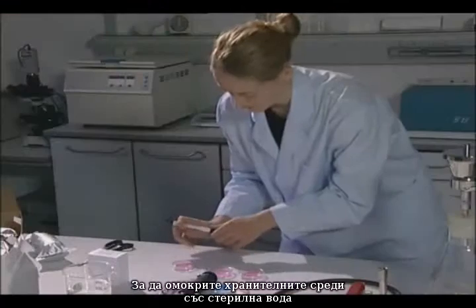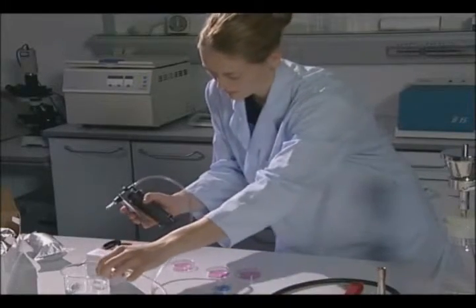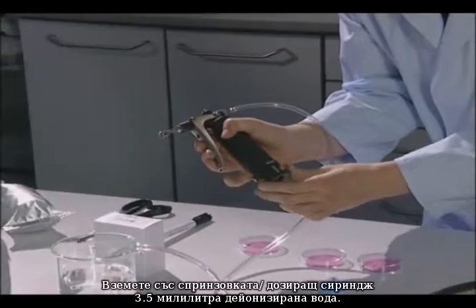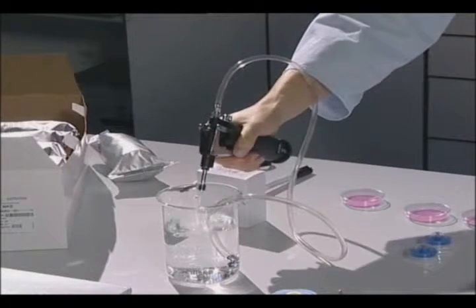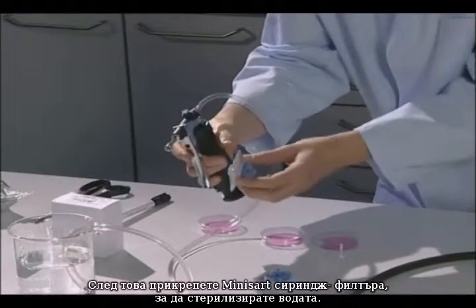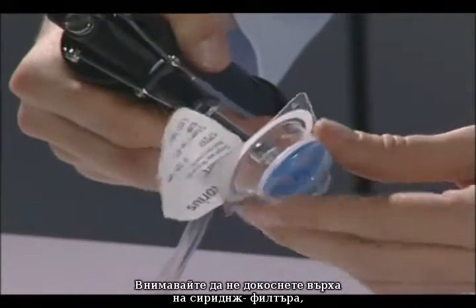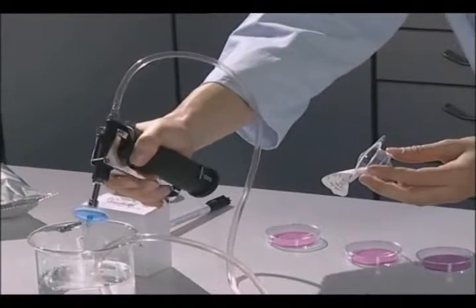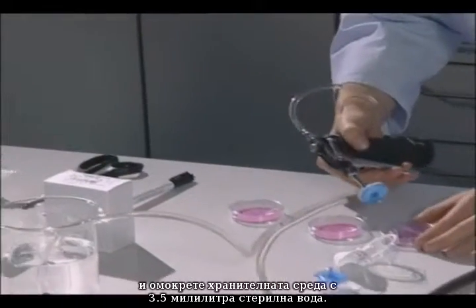For wetting the nutrient pad sets with sterile water, use the dosing syringe and a miniSART type syringe filter. First, use the selector at the bottom to adjust the dosing syringe to 3.5ml and fill with water by pumping repeatedly. Afterwards, attach the miniSART syringe filter to sterilize the water. Always be careful not to touch the tip of the syringe filter when attaching the miniSART and during later handling.